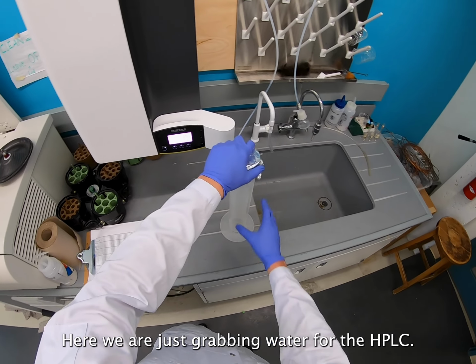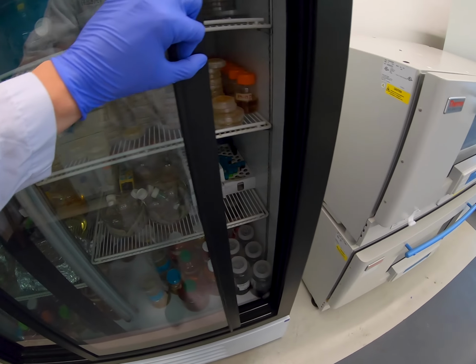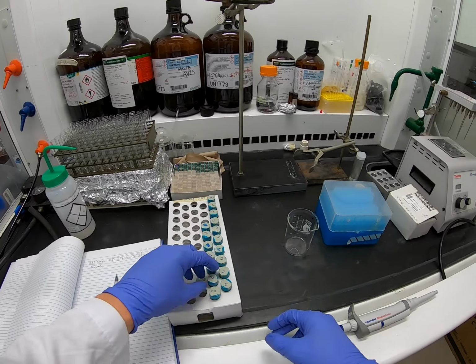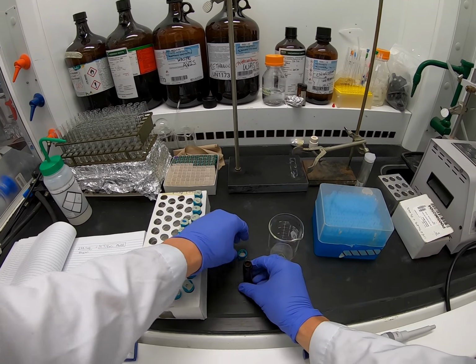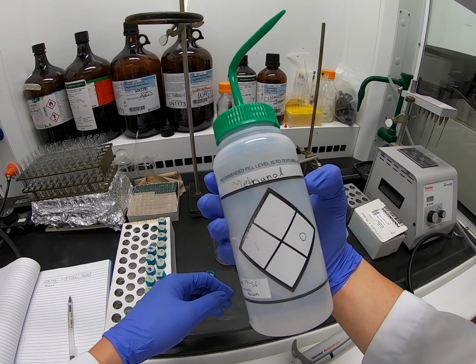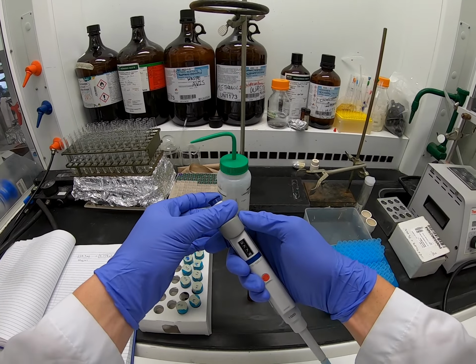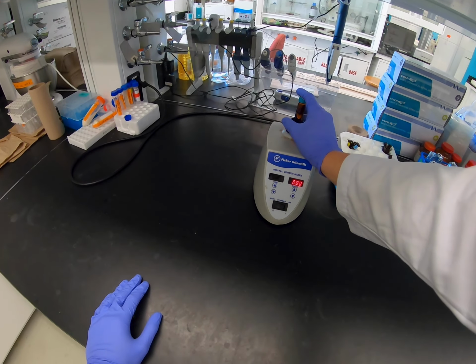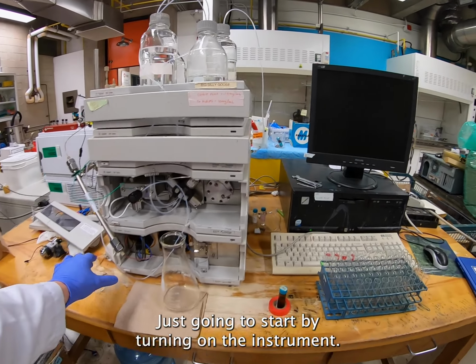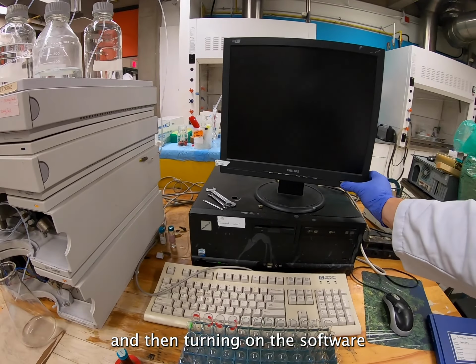Here we're just grabbing water for the HPLC. Grabbing our sample. Just gonna start by turning on the instrument. This is an HPLC. And then turning on the software.